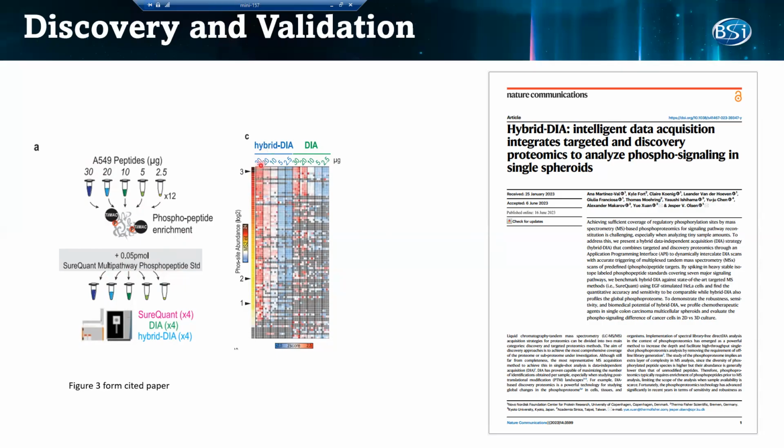First, in the PRM part, whether the hybrid DIA can find more of the triggered peptides, or our peptides of interest, since these peptides are usually the markers. Second, since hybrid DIA can also do DIA, whether the DIA part in the hybrid DIA can get a result comparable to the conventional DIA search.